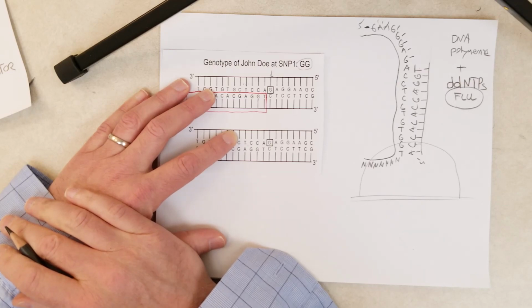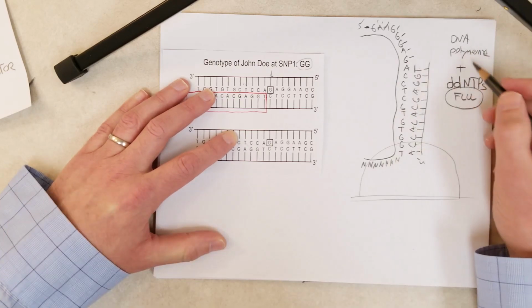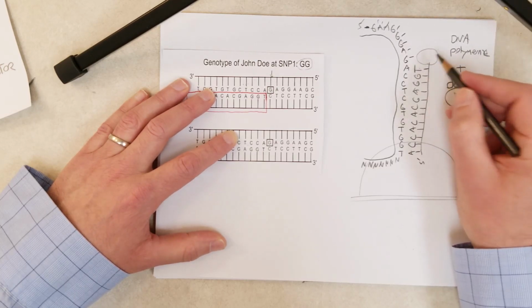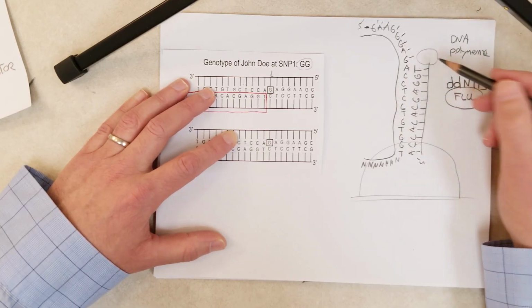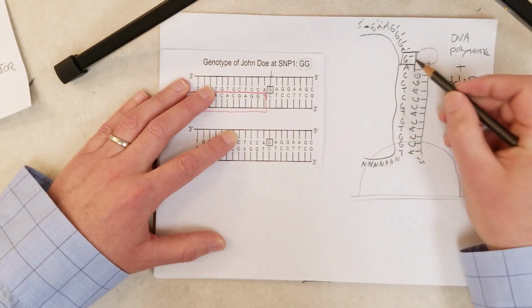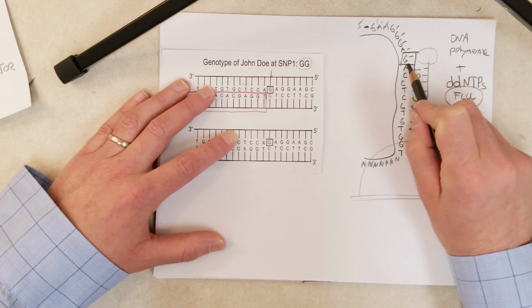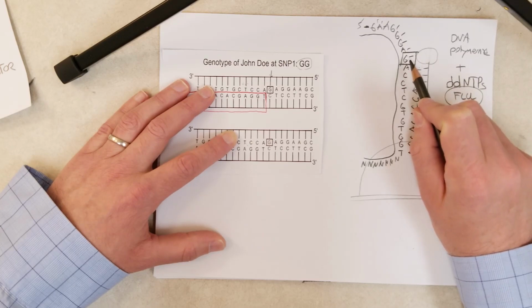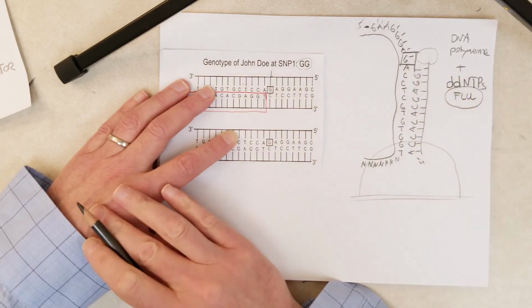So the DNA polymerase can at most add one fluorescent ddNTP at this position. And it's going to depend on the base on the annealed DNA that's opposite this position, right?